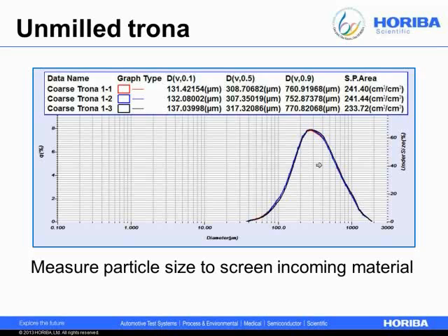The LA950 is our laser diffraction particle size analyzer. It's notable because it can measure both wet and dry. The data you're going to see over the next few slides was all captured dry simply because Trona has some solubility in water. And for this application, because you're injecting it dry, you probably want to measure the particle size in the dry state as well. Typically when you disperse materials in liquid, they disperse to a smaller, finer state than in air, and that wouldn't necessarily be indicative of how it's going to be seen by the SO2 and SO3 in the flue gas.